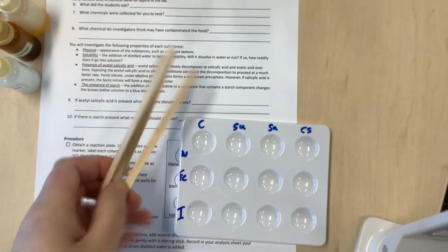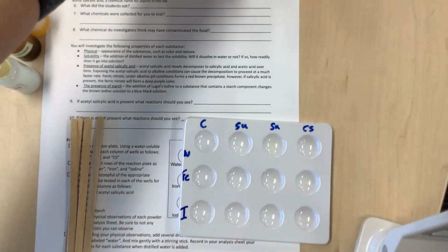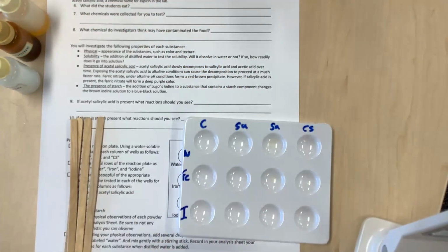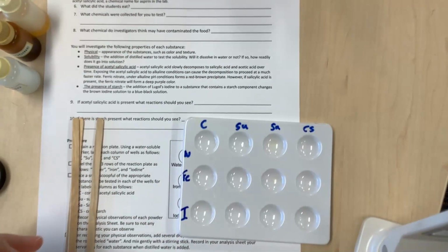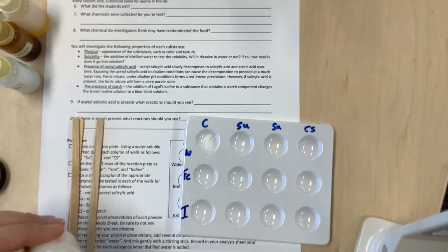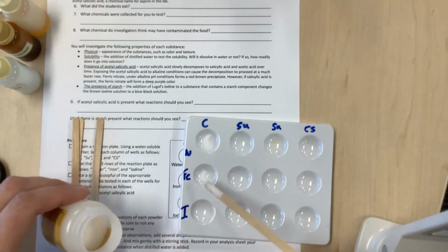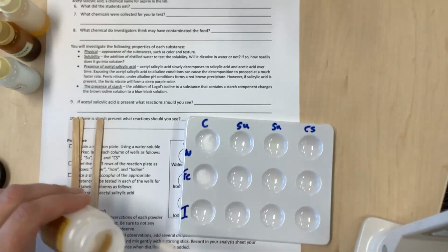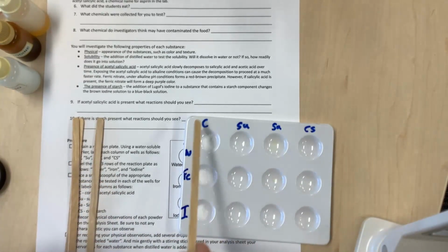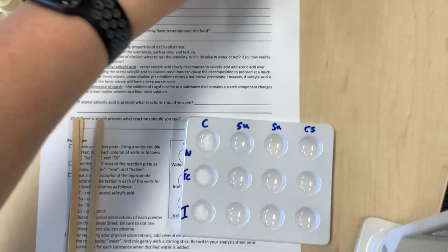So I've got my stir sticks here, which I'm using to take my solids out of their container. So this is my control here, which I am putting into each of the wells under the C for control. So the powders are labeled at the top. So I got my control in. Then I need my sugar.